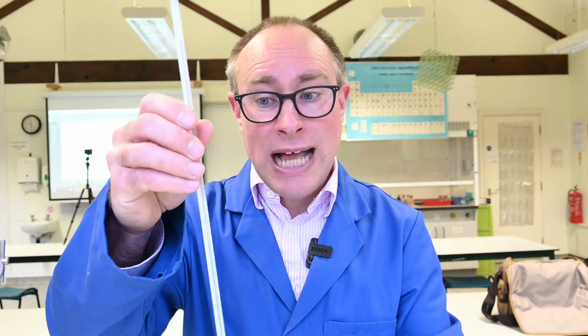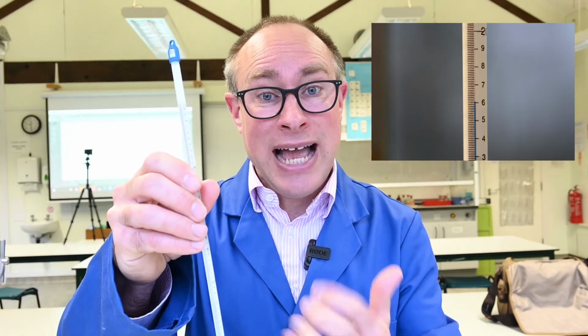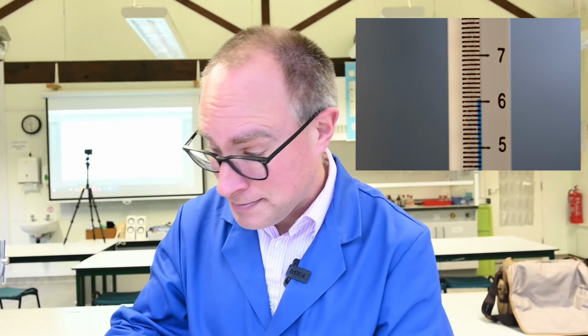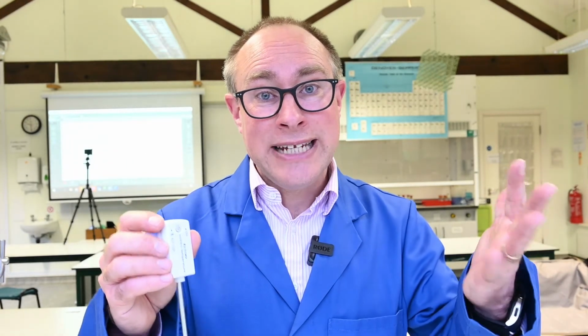Normally when we do these experiments, we use a normal accurate thermometer. These thermometers read to 0.1 degrees C, and we're currently getting a reading of about 16.05 degrees C from this thermometer. But today I'm going to use a temperature probe so I can collect the data using a laptop, and I can show you the results as we get them.